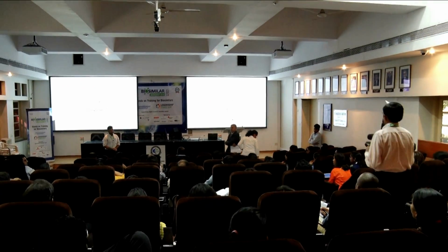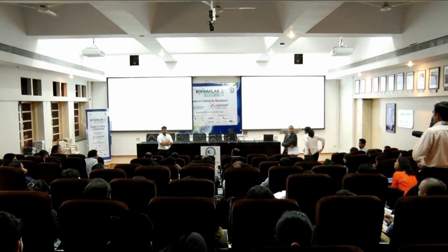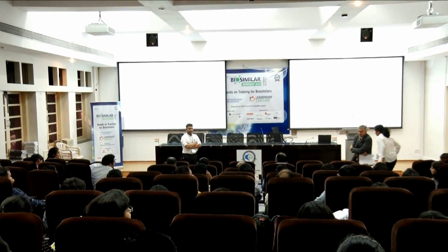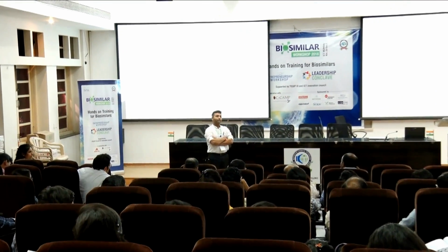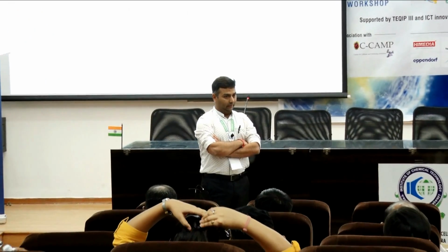Wonderful talk, and I have two questions related to the FTIR plus the antibody with peptide digestion. With FTIR in the amide 1 region, it is overlapping, but it's not completely overlapping, the peaks in the amide 1 region. So what do you go for, are they similar or not?